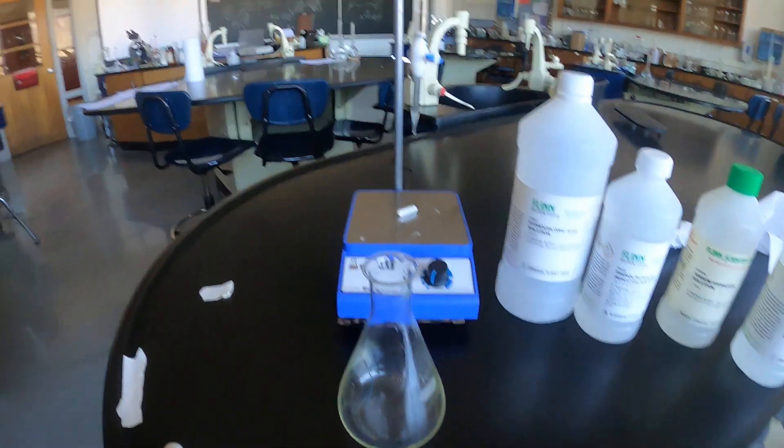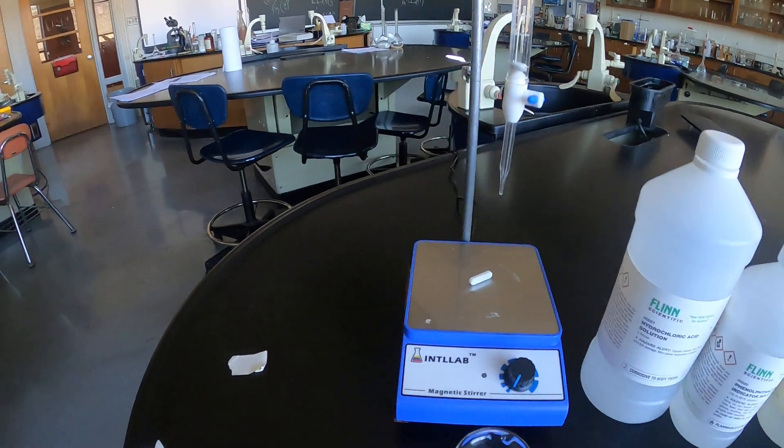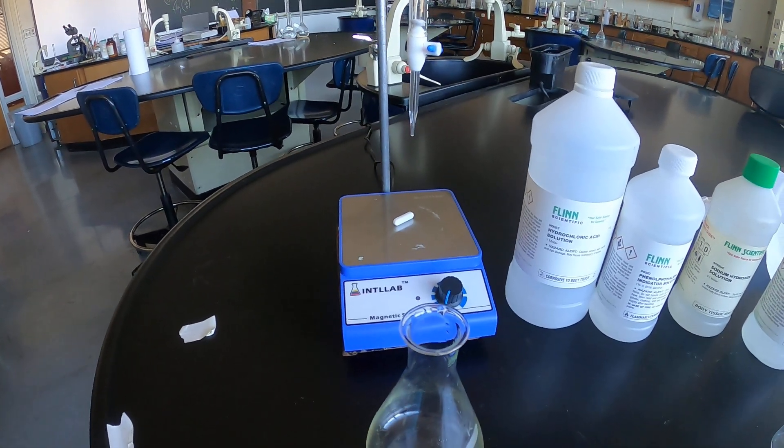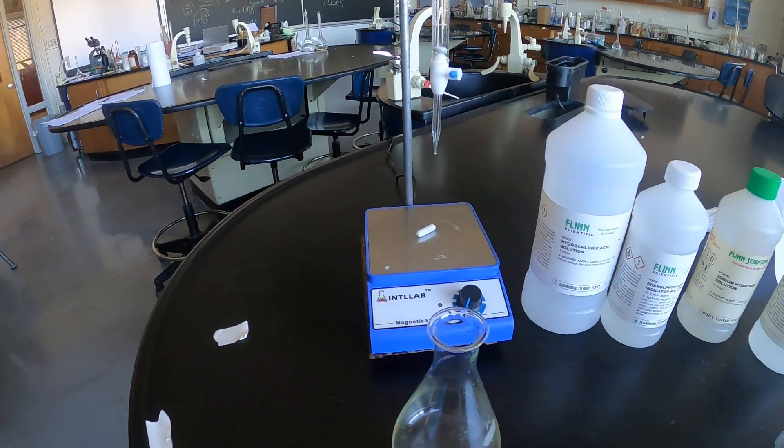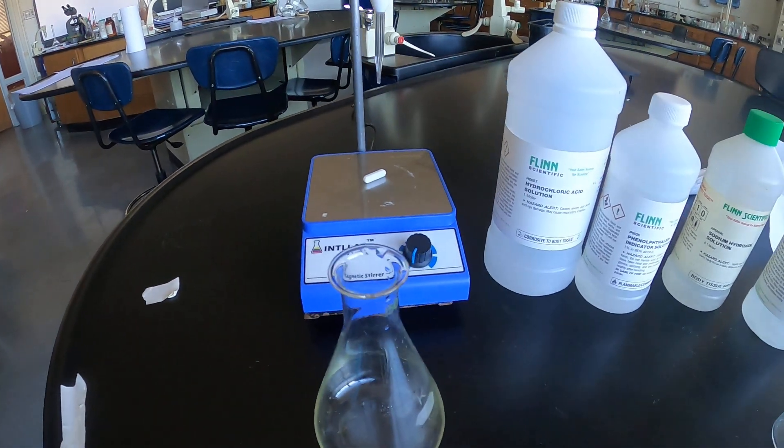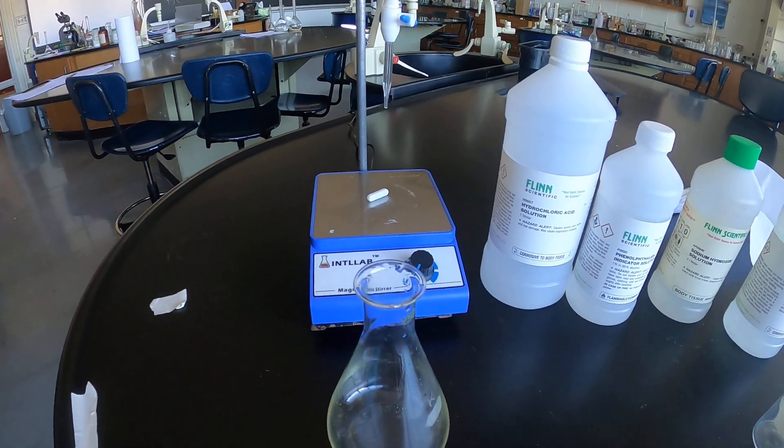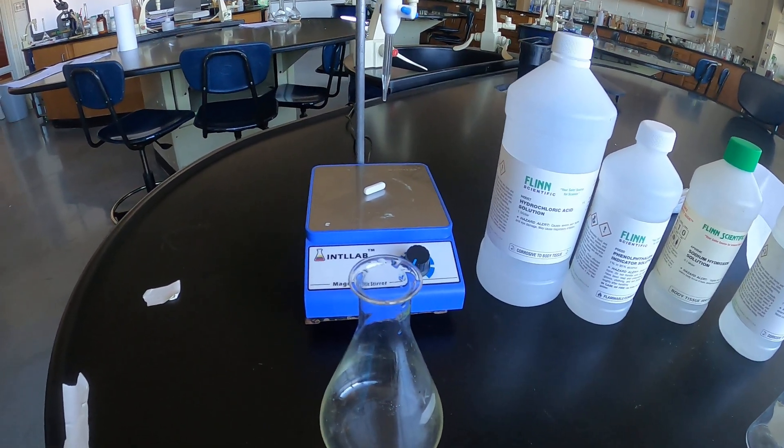Alright class, this is going to be the VR pre-lab for your titration activity which is from the last section of this chapter. You get two double periods to run this. It should only take you one double to run the experiment and maybe another singular period to do the calculations.